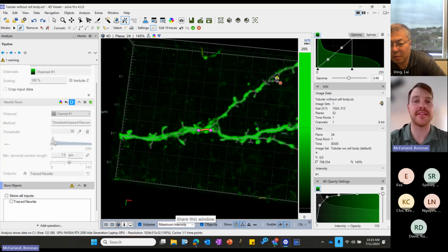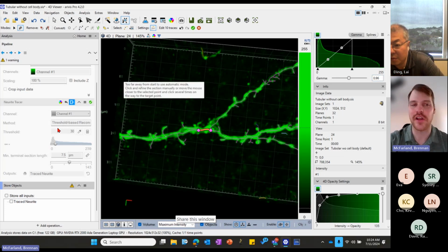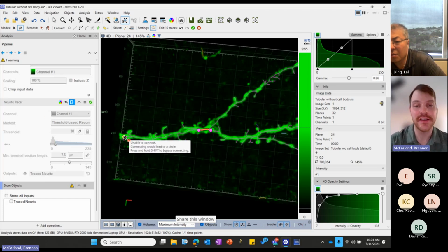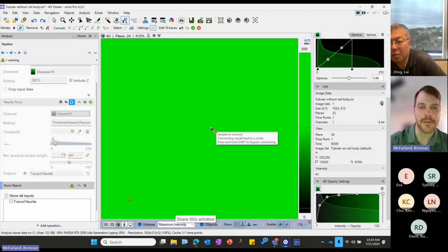usually what I would recommend is, because this is still using some math and the local intensity, using its best guess to trace these, I would recommend just starting off when you're doing this automatic tracing using this function here, just get the best result that you can out of here. And then I'd probably just do some manual editing afterwards.